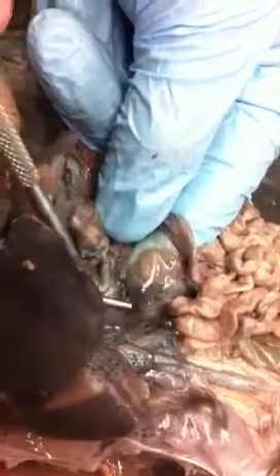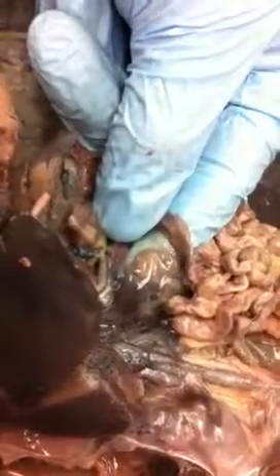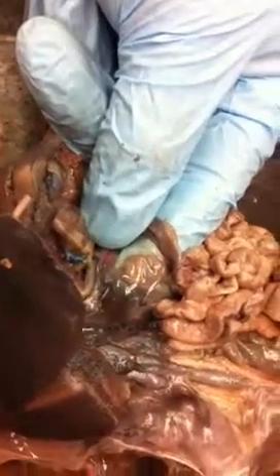So it's just this dark looking. You can even really see it on the fetal pig, particularly. Yeah, like this, I think it's kind of blown out. This pudding-looking stuff right there. Okay. So the portal vein goes from the capillaries of the intestine to the capillaries of the liver. That's why they call it a portal vein.